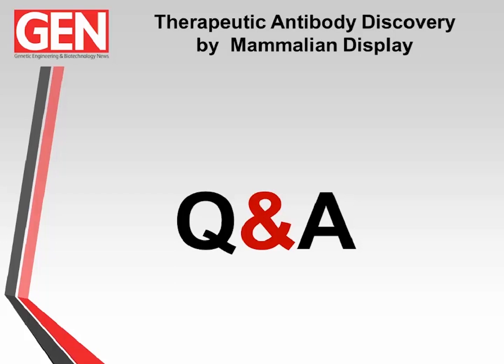All right, thanks, John. And actually, we have time for one more question for Payal. Payal, what's the advantage of using electroporation compared to a transfection reagent?